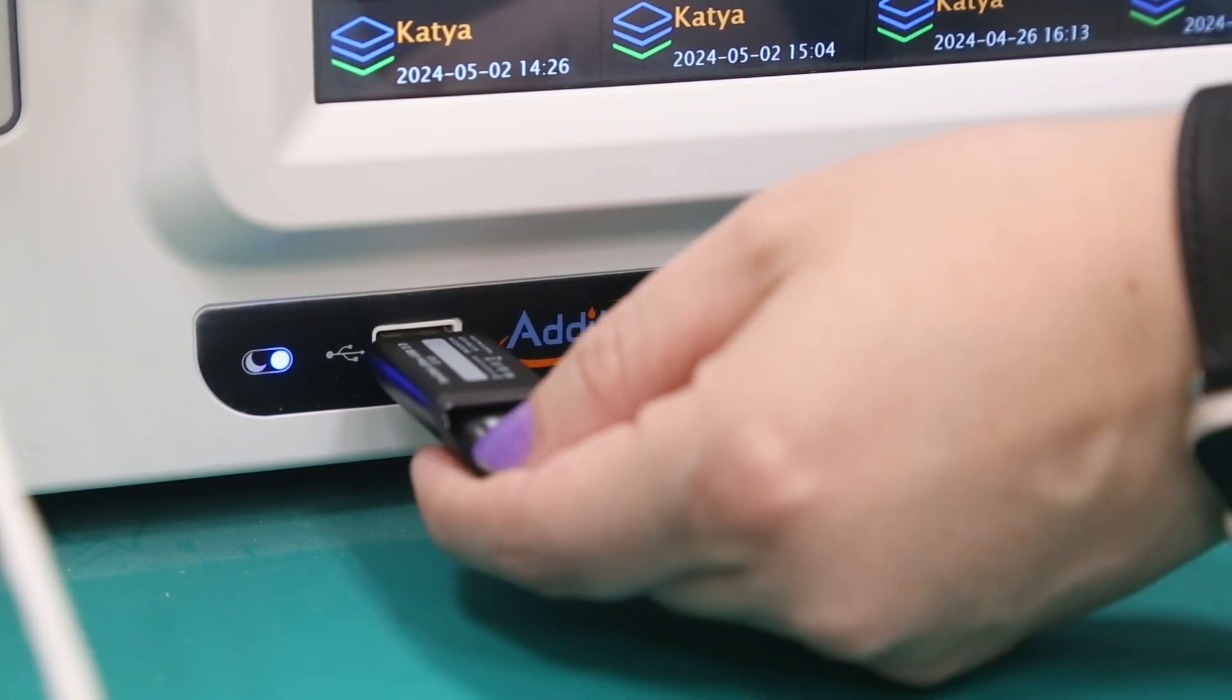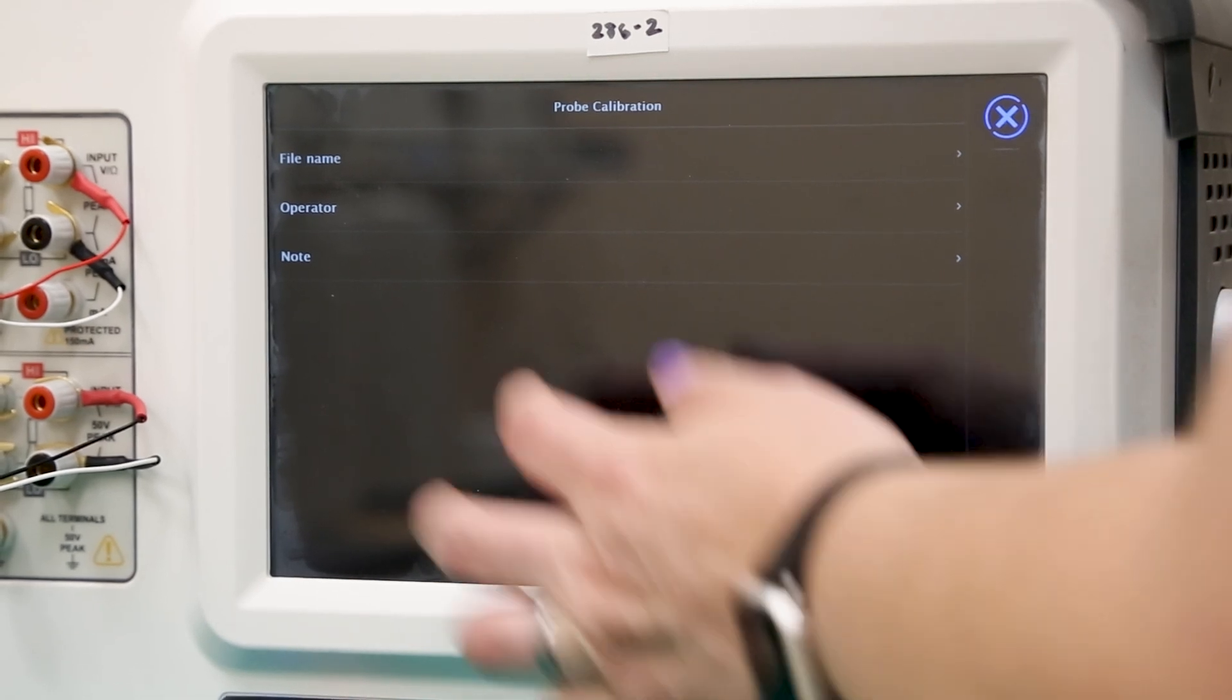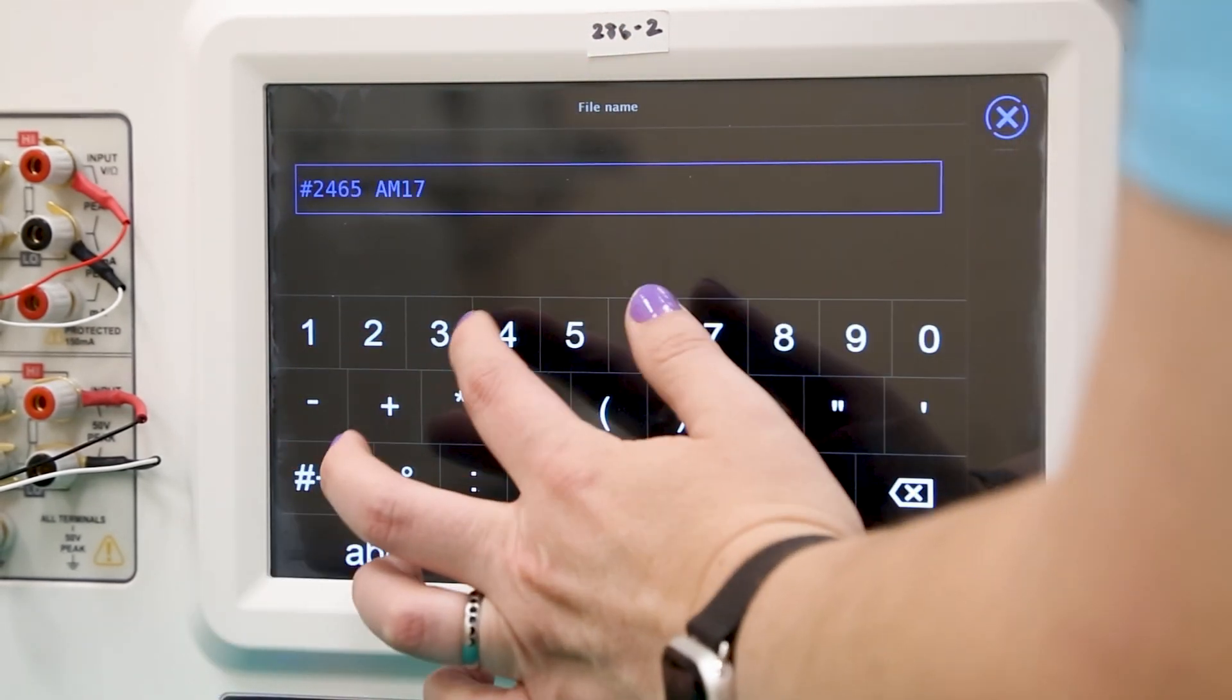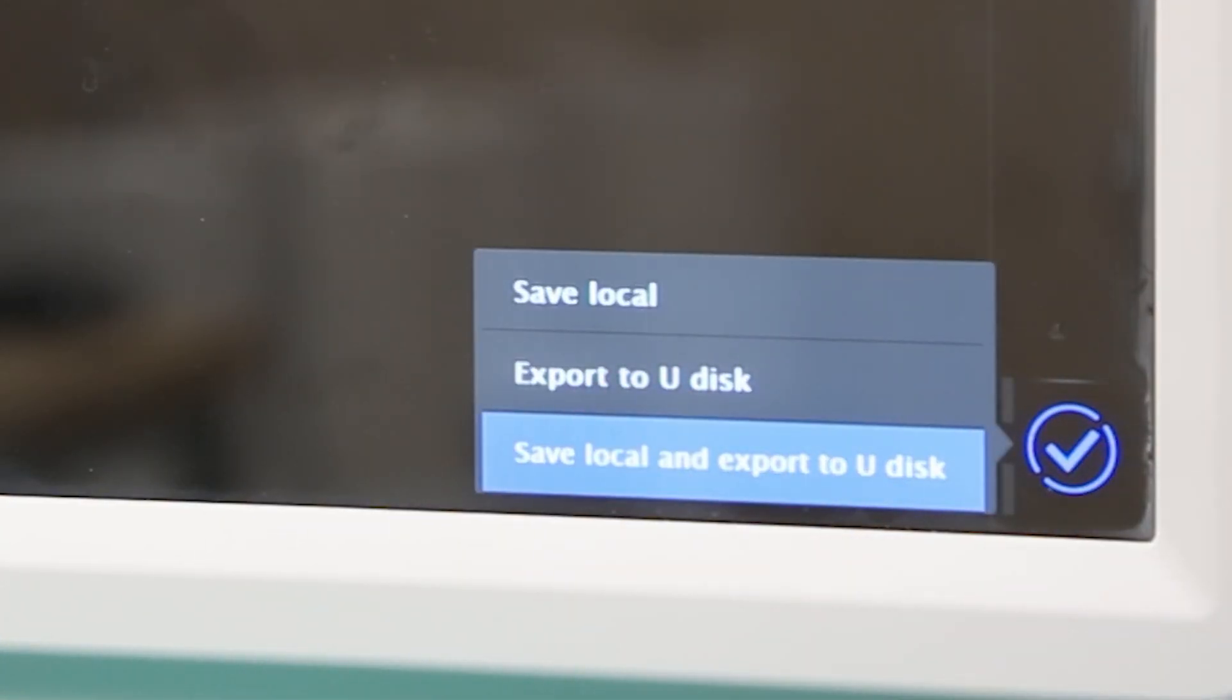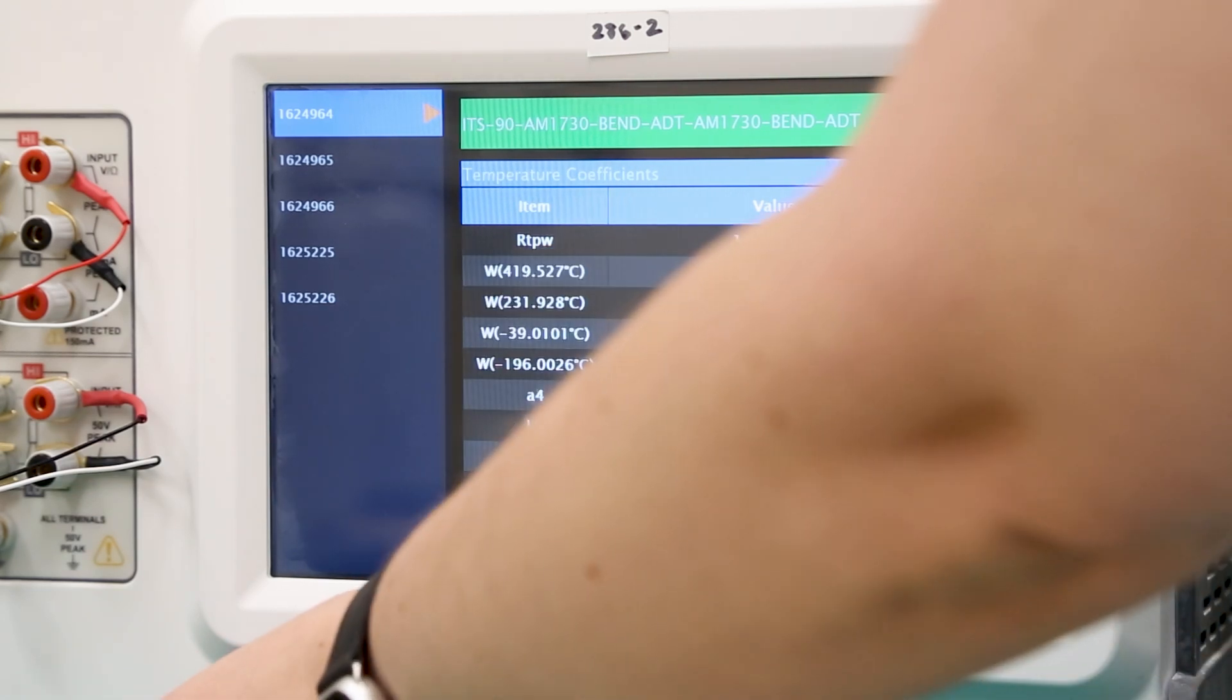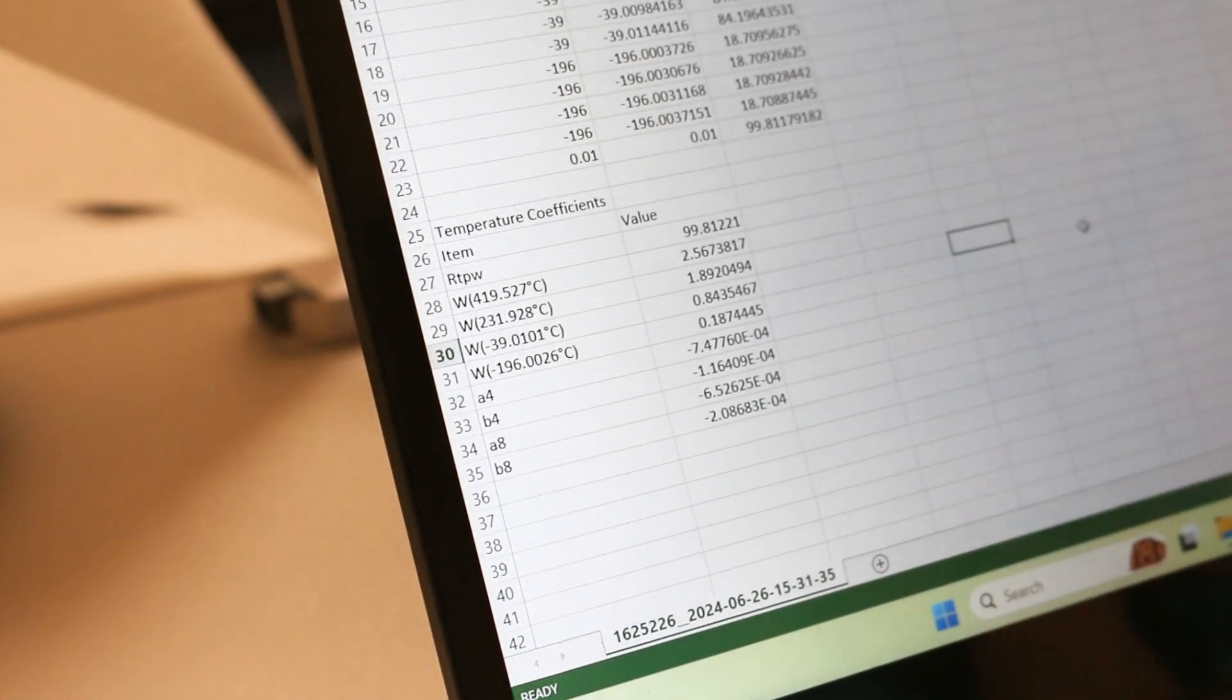These results can then be saved and exported by first inserting a USB drive, then pressing the next arrow in the bottom right. Here the user can enter the file name, the operator name, and any extra notes about the procedure, before exporting by selecting the Save Local and Export to Udisk option in the bottom right corner. Once exported, the data and coefficient calculations will be stored on a CSV file, to be easily accessed and organized using any spreadsheet program.